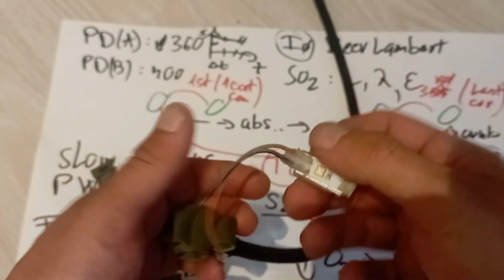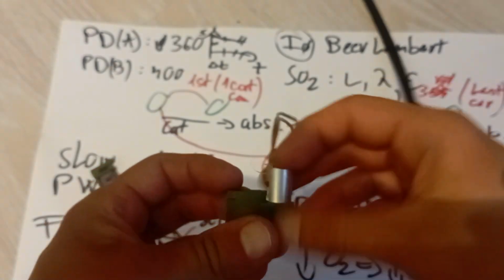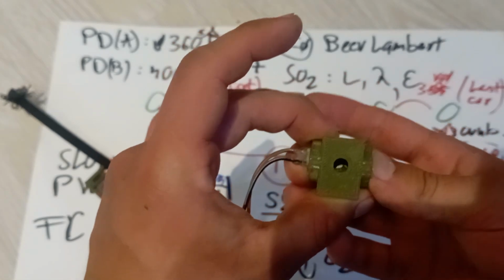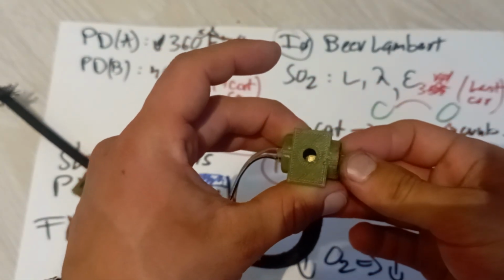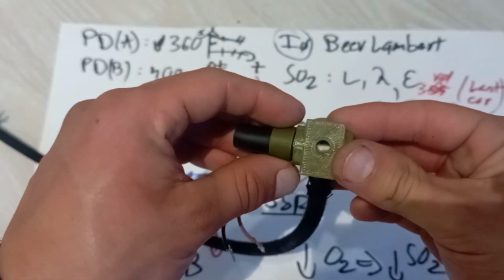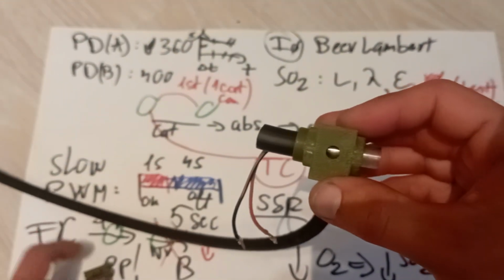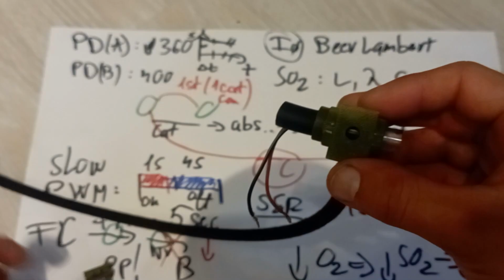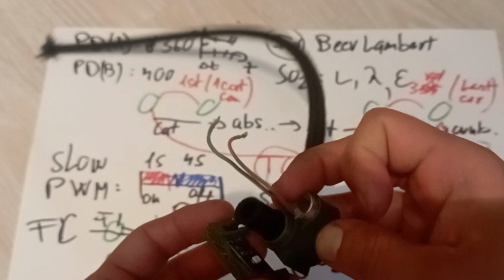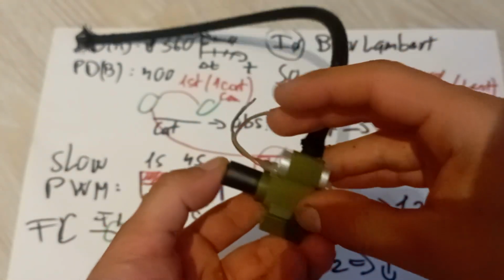So yeah, this goes in here. This is a cable with proper cable management. You can just put this back into its place. It has this little hole there, and you can see the LED light there. It basically shines through the tubing. This is just to get stuck, to be able to hold in place. As you can see, it shines through there, and basically it illuminates the little GUVA here, and this slides on there. So it's a really compact system.